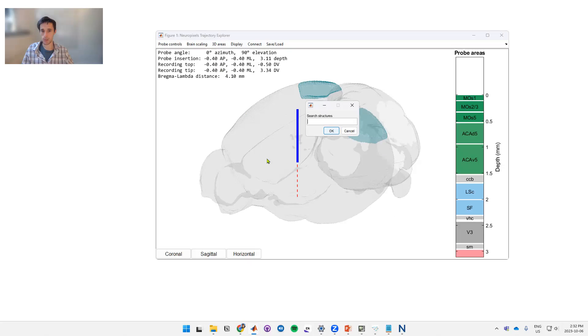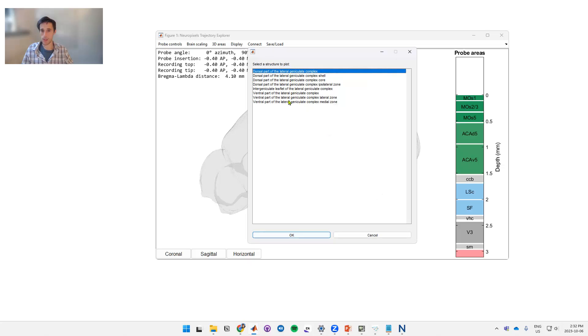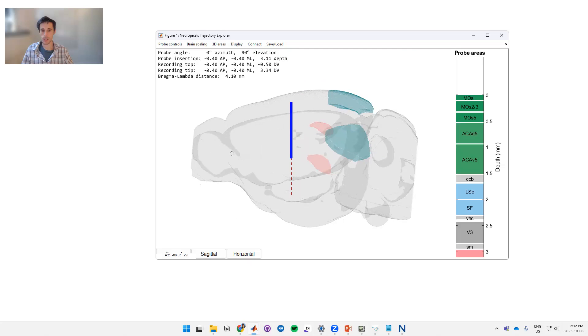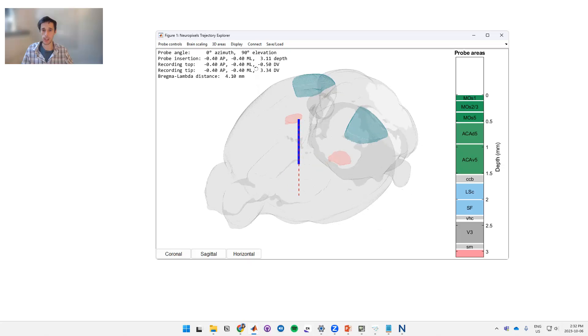Next thing we'll do is add the lateral geniculate. We'll just type in lateral gen in this case and it pulls up all the matches. So we'll click this first one which is the dorsal LGN. Okay, so now on the brain we've got drawn the primary visual cortex and the LGN.